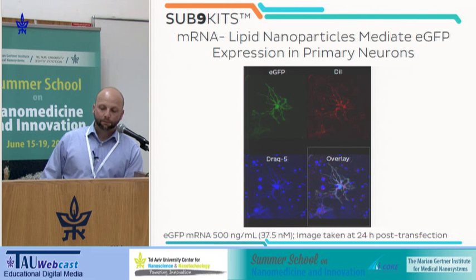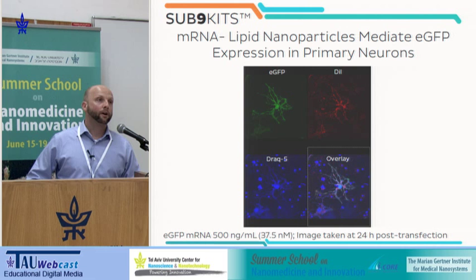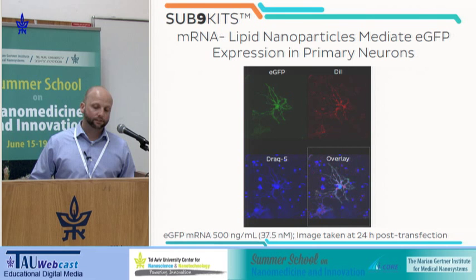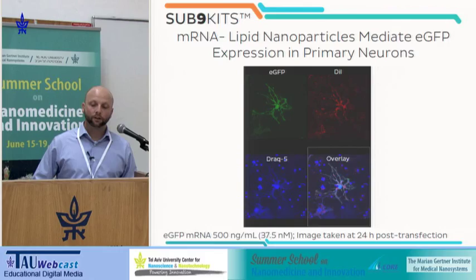Lastly, and you probably can't see it on the screen there, so you have to take my word for it, but we're also heavily involved in mRNA delivery and other types of delivery systems as well. And so we're getting very good protein expression using mRNA constructs. And I think this is a very exciting area, with lots of interest in the drug world, but also in the research world, using this as a tool to more rapidly do functional genomics.